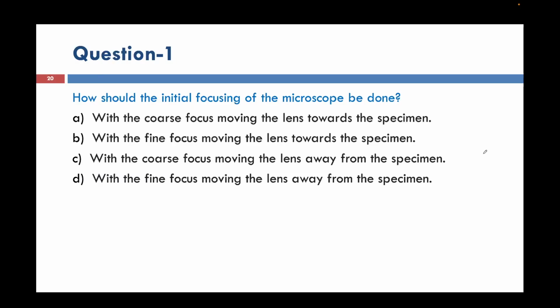So one answer is A, another one is B. Okay, so we'll see the coarse focusing, the initial focusing of the microscope. How can it be done?